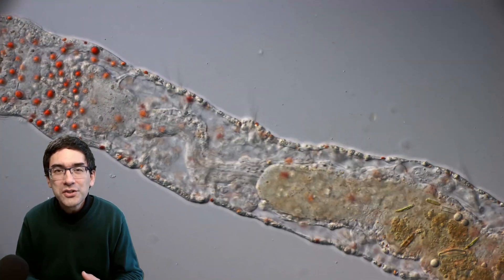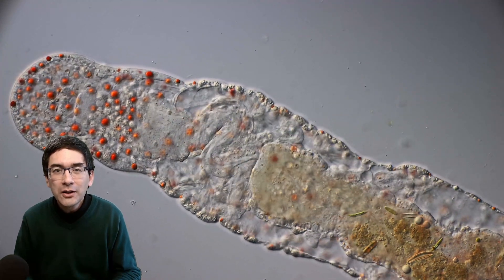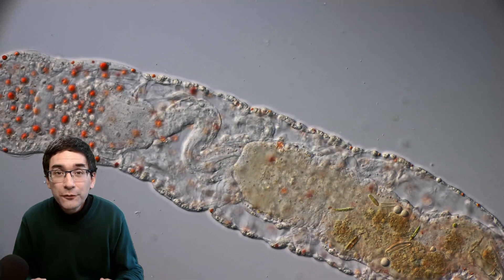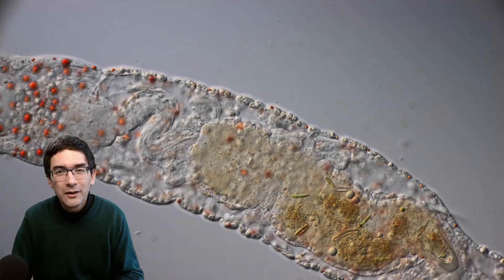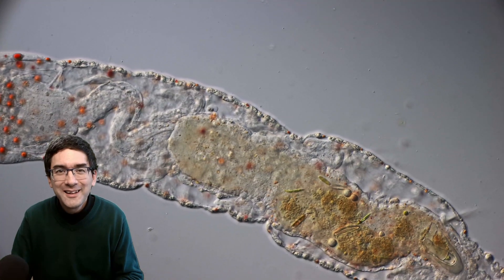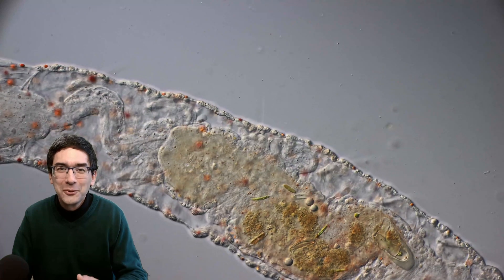The worm uses those bristles to move forward because they can be used to anchor into the ground to increase friction so that it's able to push itself forward. On my smooth microscope slide, the worm did indeed have some problems pushing itself forward.